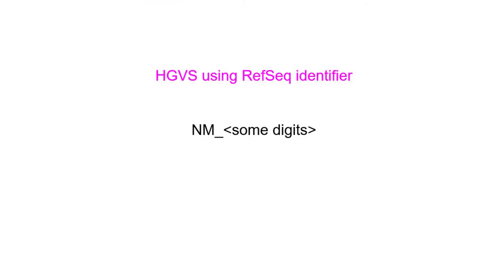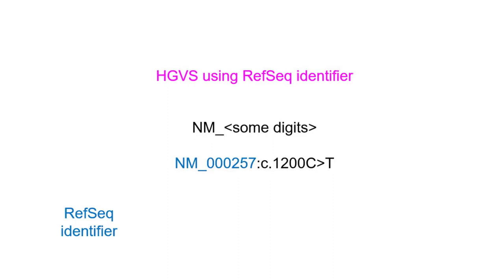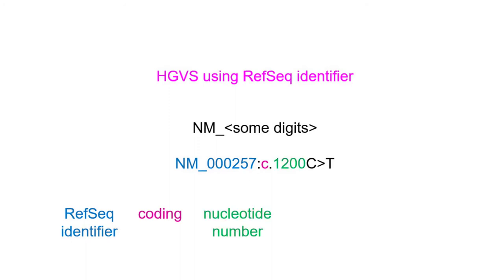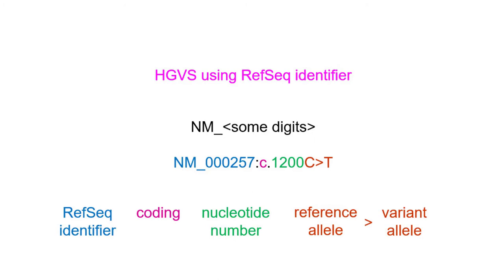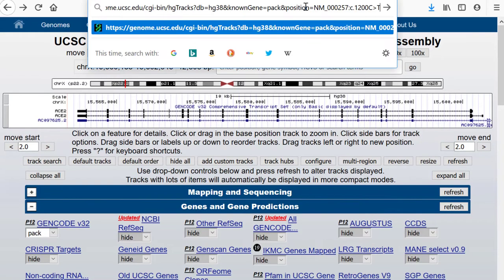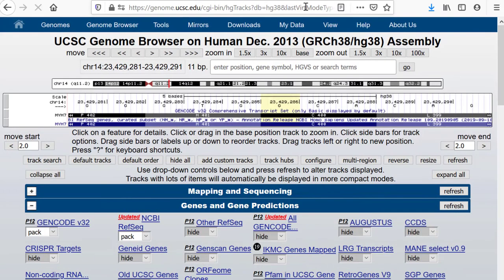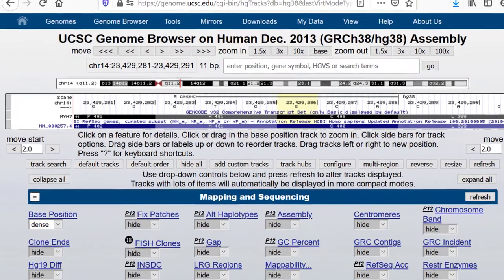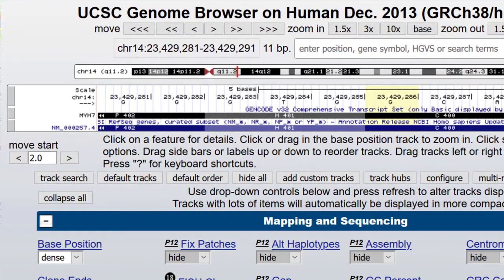RefSeqs are in the form NM_underscore some digits. For example, NM_000257:c.1200C>T is HGVS that identifies the 1200th nucleotide of a coding DNA, which will be in the 400th amino acid. Let's add that to the URL as a key value pair specifying location — ampersand position equals the HGVS designation — and we'll drop the hide tracks parameter. The browser will find the location and highlight the nucleotide with five bases of padding on either side.